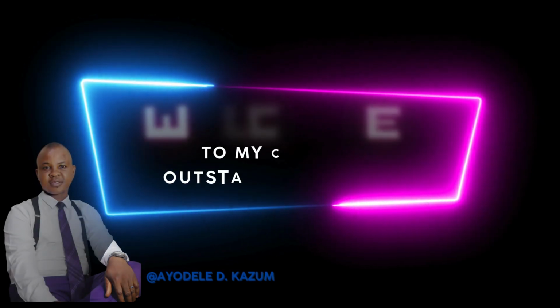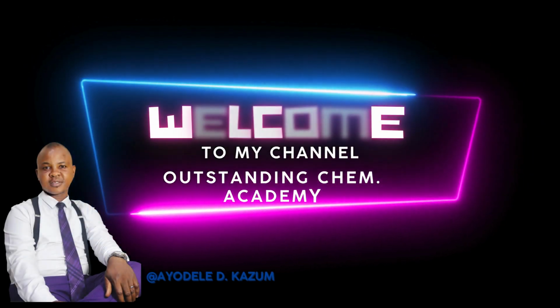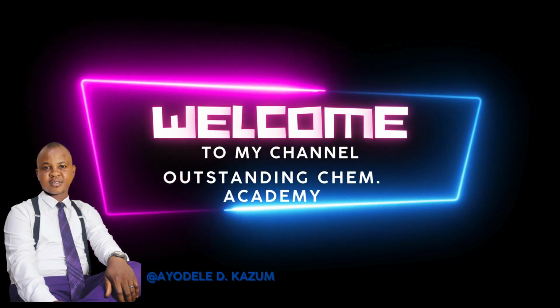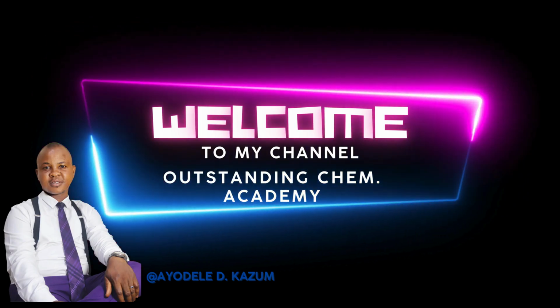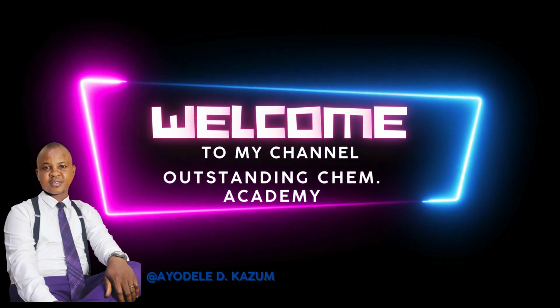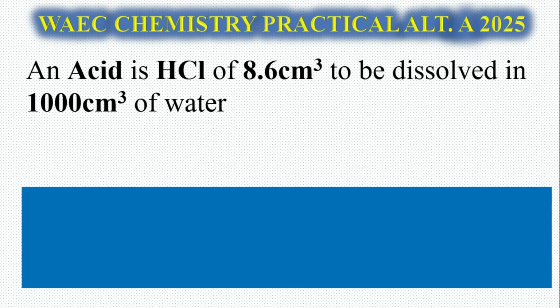Alright, this is WAEC Chemistry Practical Alternative A 2025. I believe A is sure. Alright, let's clearly look at the titration aspect of WAEC Chemistry Practical 2025. Let's start with the yellow paper.